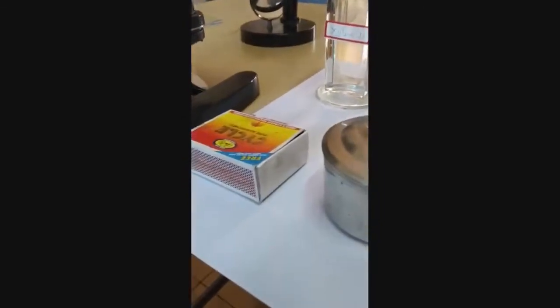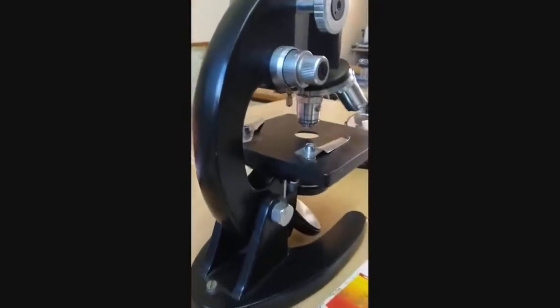A spirit lamp and matchbox to heat the slide and a compound microscope to observe the slide.